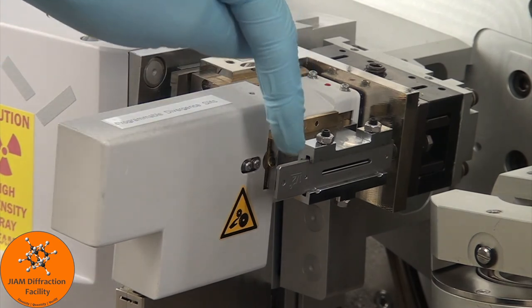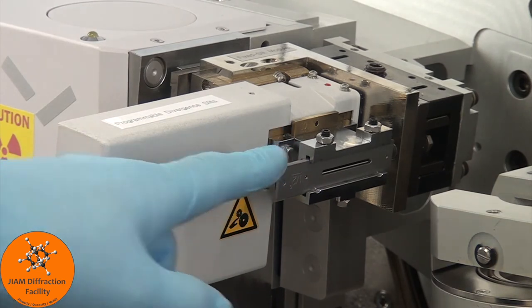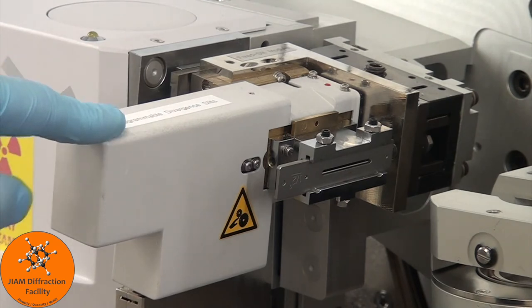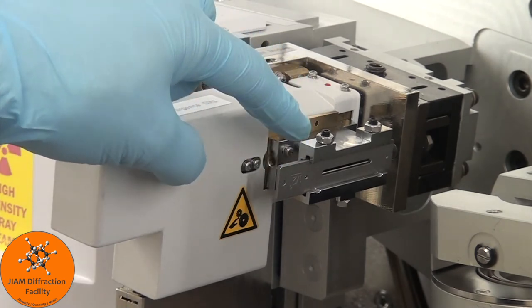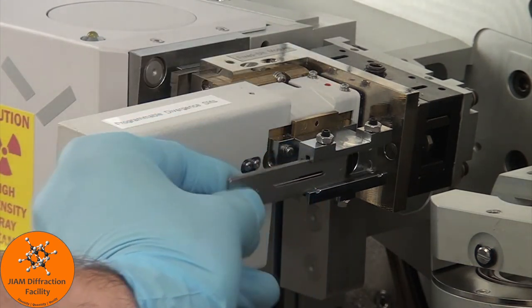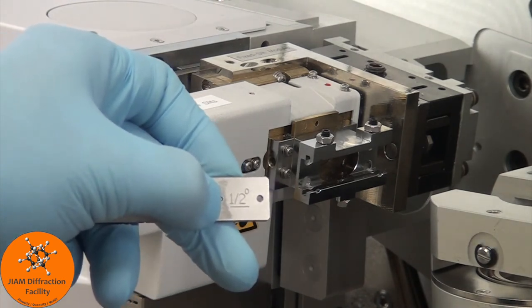Finally, we have the anti-scatter slit shown here, and this reduces background due to X-rays scattering off the air. Now this needs to equal 2 times the divergence slit. So if the divergence slit is 1/4 of a degree, this should be 1/2 of a degree. If you need to change it, you can simply remove it. We see right here that it is 1/2 of a degree.